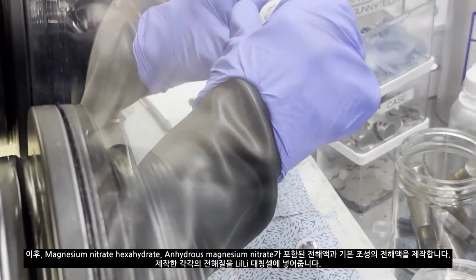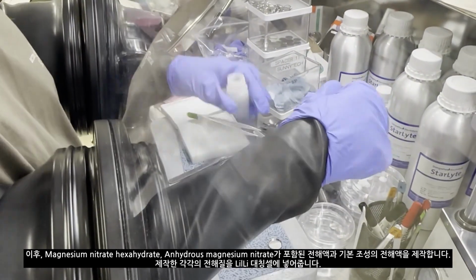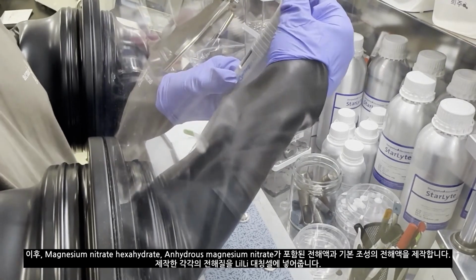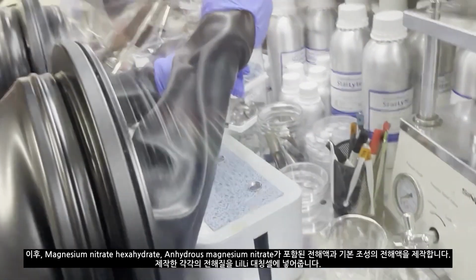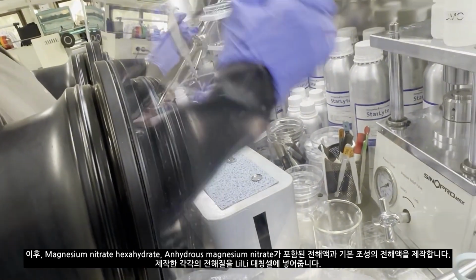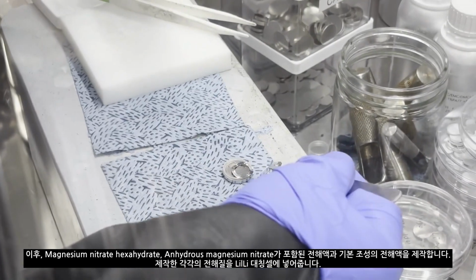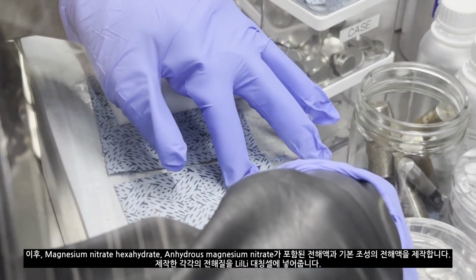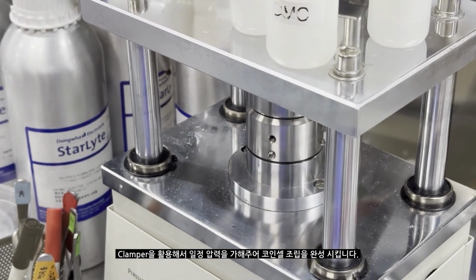Next, electrolytes are prepared using hydrated magnesium nitrate, anhydrous magnesium nitrate, and a base composition without any additives. The prepared electrolytes are then introduced into lithium symmetric cell. The assembly of lithium symmetric cell is completed by applying pressure using a clamper.